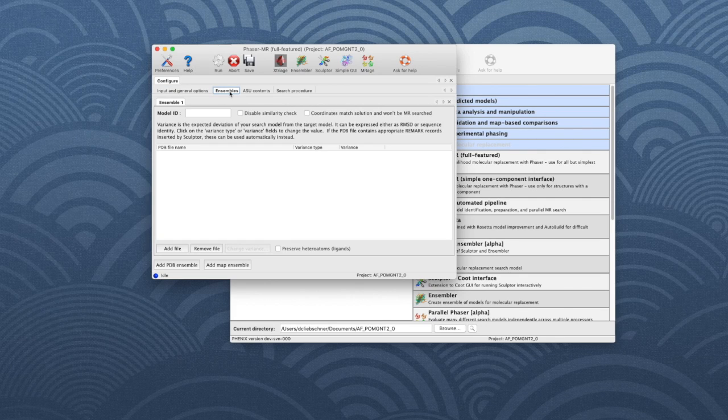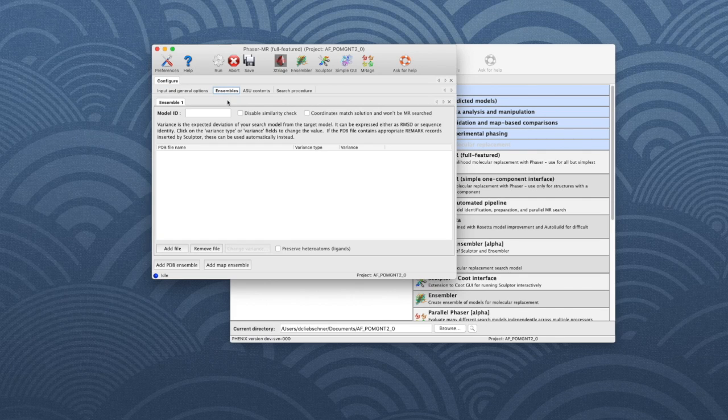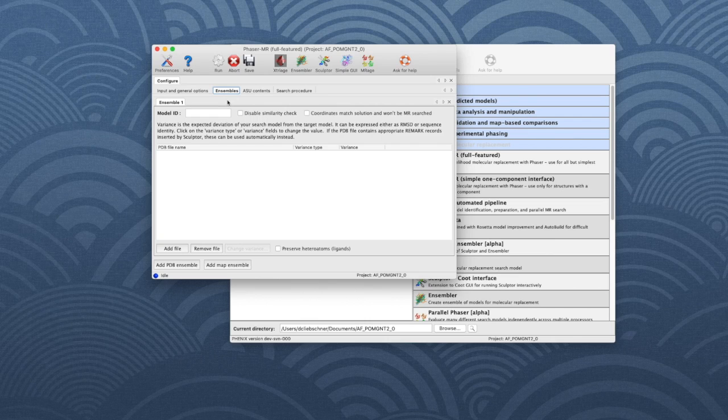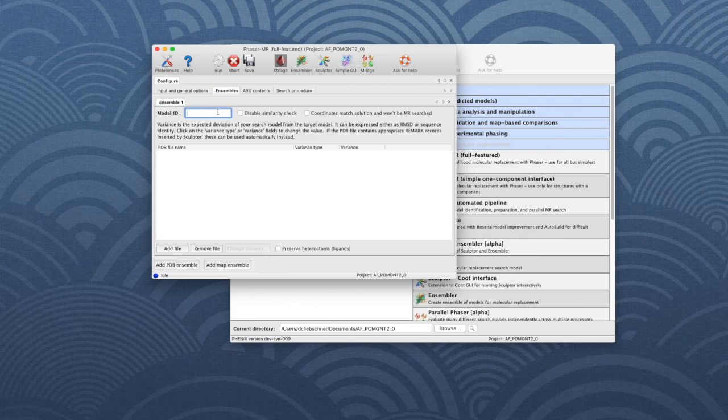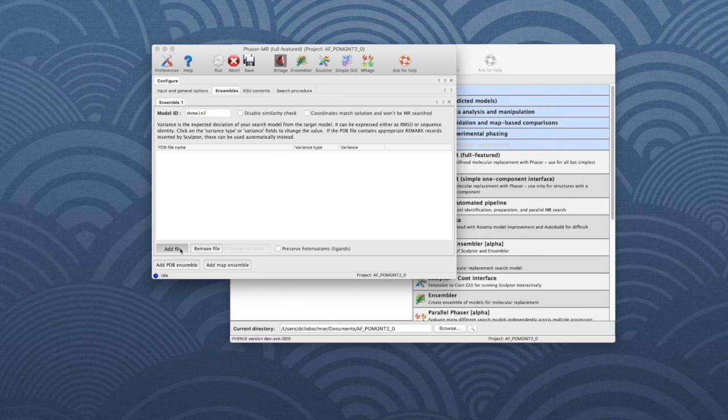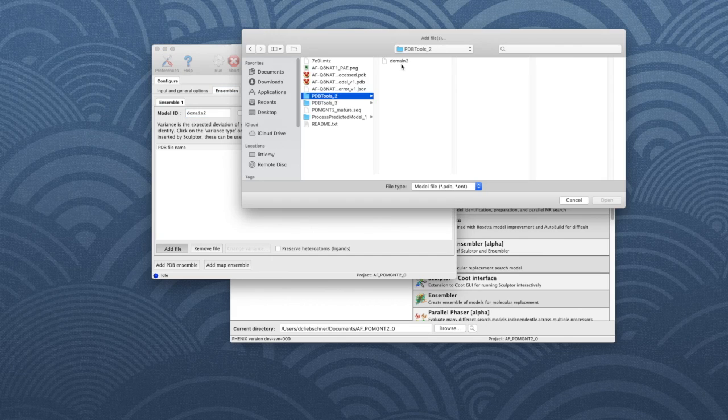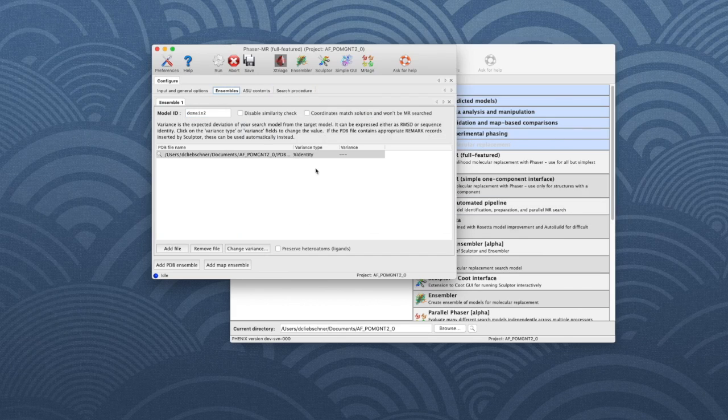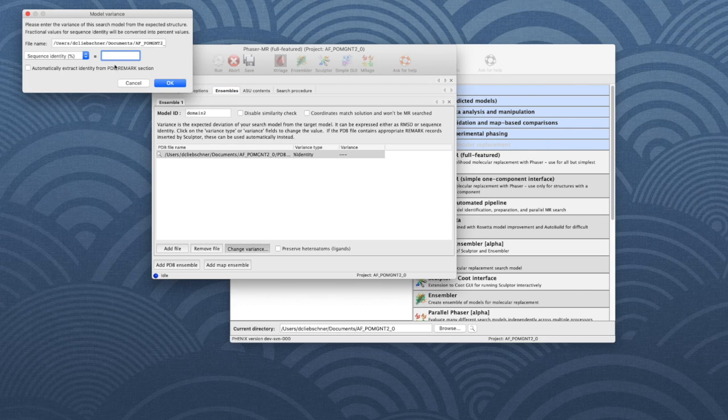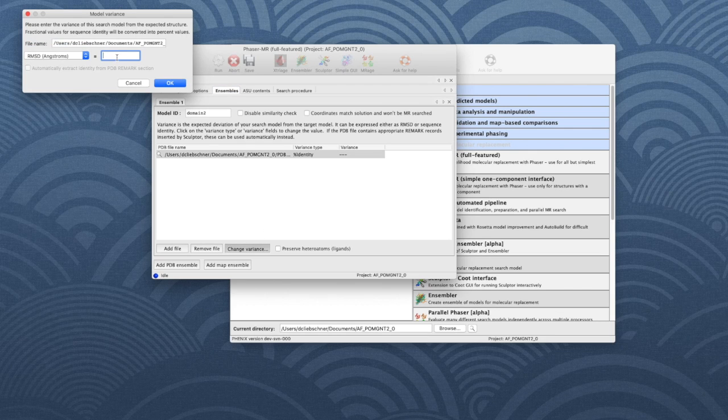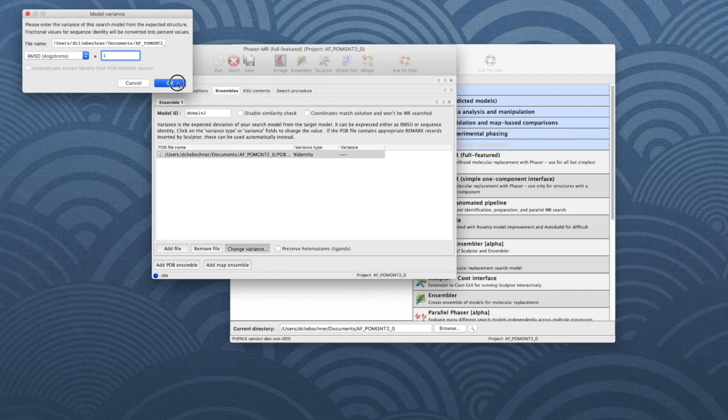In this run, we will only use one model for each component, but you can use an ensemble of alternative models when you run MR on your data. We start by defining the first domain. Give the first search model a name, here domain_2. Click on Add File to add the model file. Let's change the estimated error or variance. We will specify it with an RMSD of one angstrom. Then click OK.